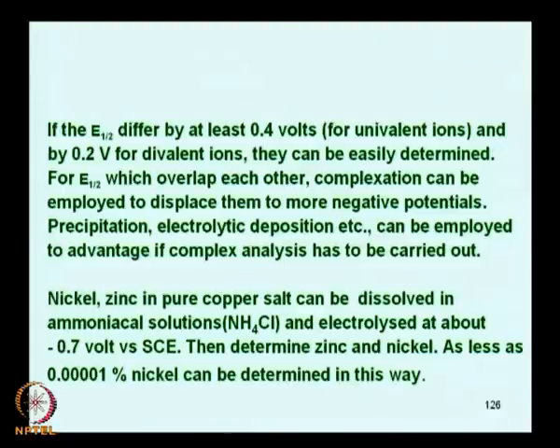So, as little as 0.00001% nickel can be determined in this way. Like this, you can gauge the potential of the method to determine very small quantities even by polarography.